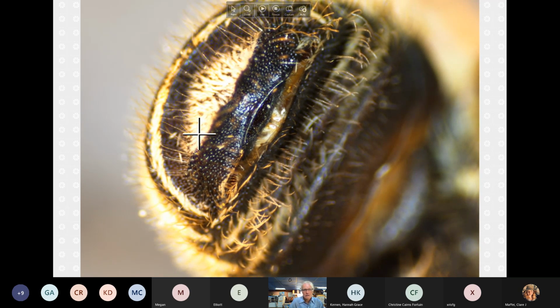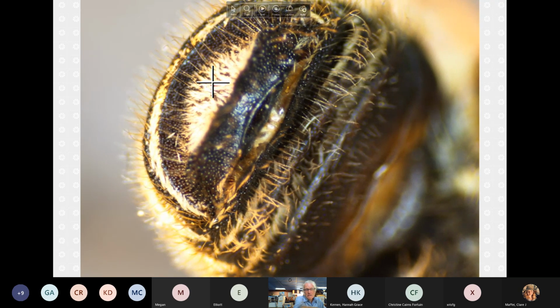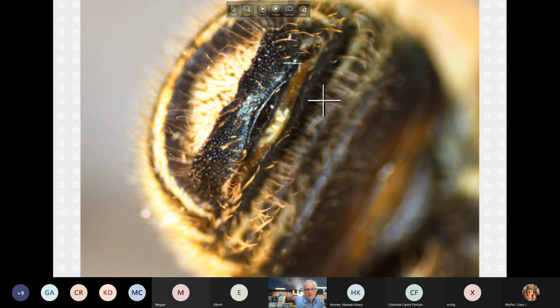So now, remember, here's the character. These are the hairs that are appressed and show up on the top of the dorsal part of T7. This is the flange, the edge of the flange that we're looking at is the notch. There's the notch with an oblique angle. I'm going to change the focus. So there we go. So here's what looked like the rim. Okay, it's right there. But this is actually not the true rim. It's just a flange above the rim. So this is the true rim down here.